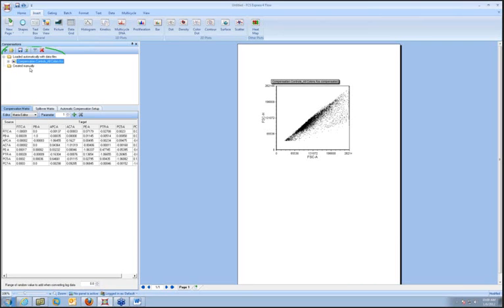Again, that's a useful thing if you want to take a particular matrix from a data file and potentially modify it or keep it alive and apply it to other data files that had different matrices. You can drag it from the loaded automatically section and put it in the created manually section, and at that point it's really up to you when to delete that compensation and when to use it. It's not automatic anymore.